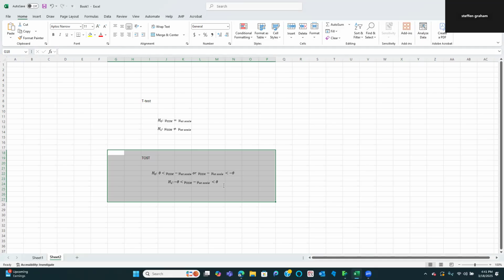So that theta might be one, two, or three times the standard deviation for a certain response of your at scale historical data. You can also use things like, this is where the SME judgment comes in a little more, I've used in the past the assay variability to define our equivalence margin, or equipment capabilities. Those types of things definitely come into play for picking theta as well.